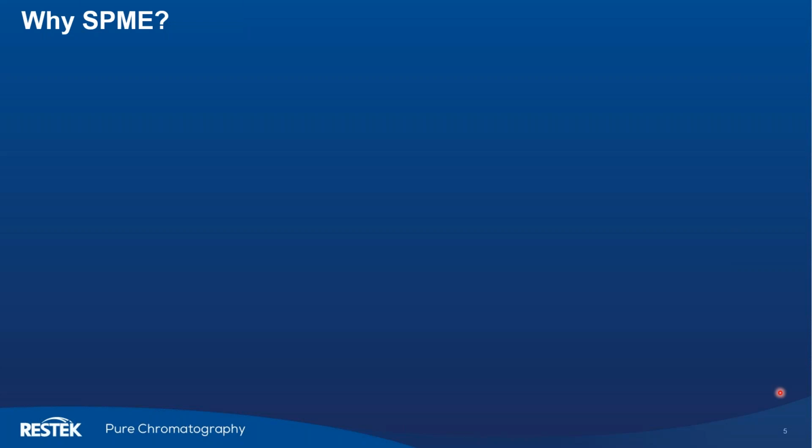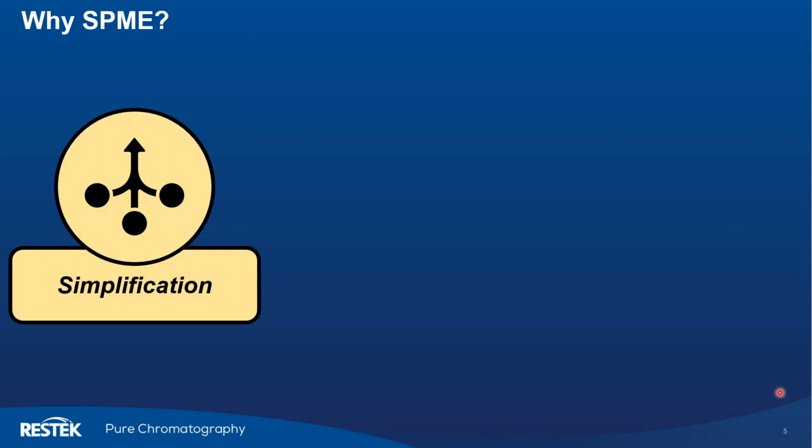So why would we want to approach SPME and potentially use this within our laboratories? Well, one, it offers simplification. Solid phase microextraction is a great technique that offers both the sample extraction or sample preparation, as well as the sample introduction into our GC inlet in one device. So everything has been integrated into one device. You don't need multiple devices like SPE cartridges or anything else to then move to a liquid injection on your GC.